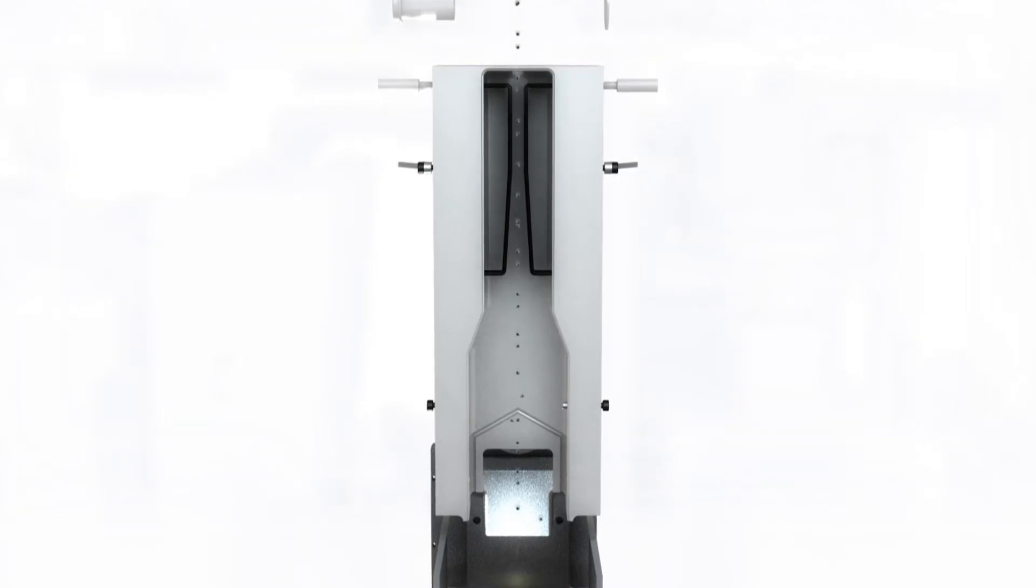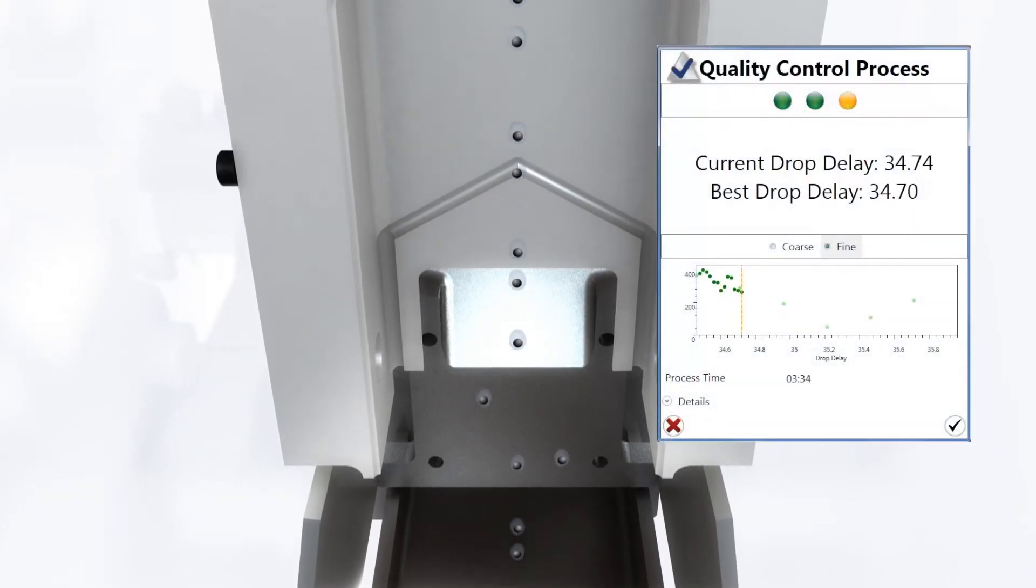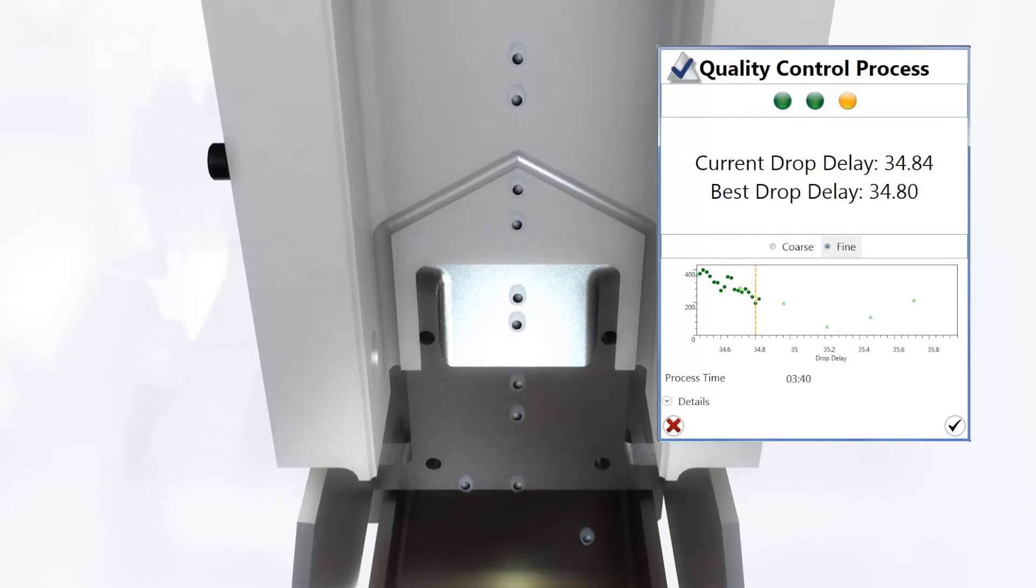The time between the moment of illumination and the exact point where the stream begins to form individual droplets. Imprecise determination of the drop delay leads to poor yields and reduces sample purity.